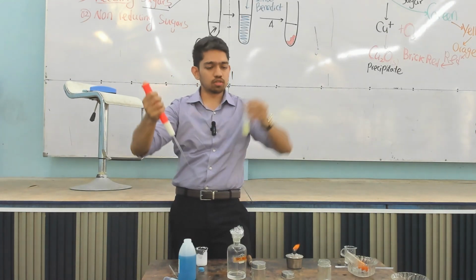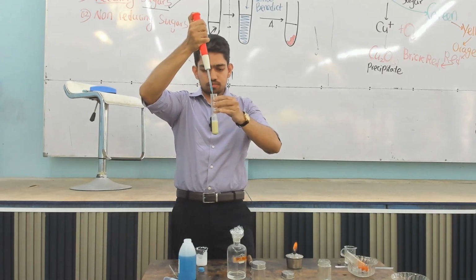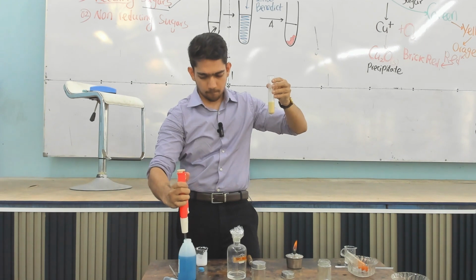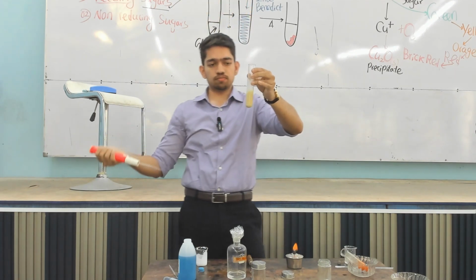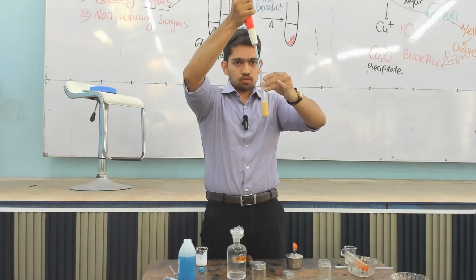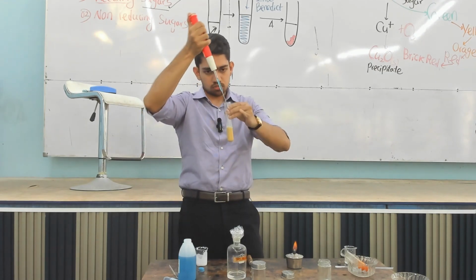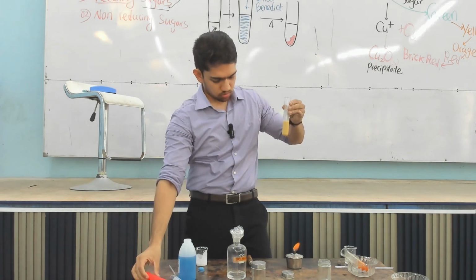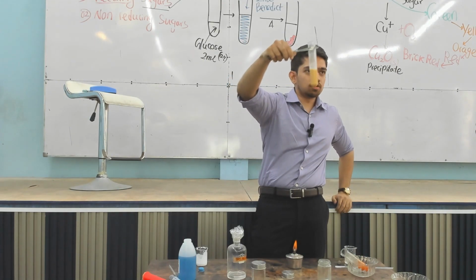That means what? The sucrose has been converted, right? There is some residual heat from the previous boiling. Can you see the color, right? So let's see what's going to happen. Hello people, can you see? Let's add a few more Benedict's, right? Okay, right. Already we have a positive result, right? Yeah, we already have not the blue color of Benedict's. There is already a yellow orange color.